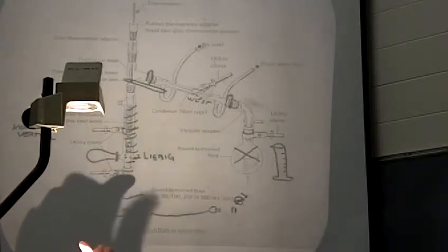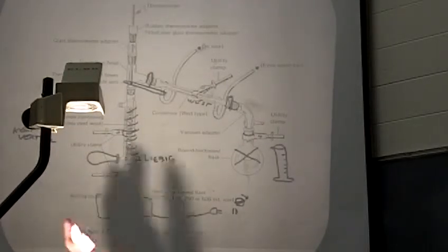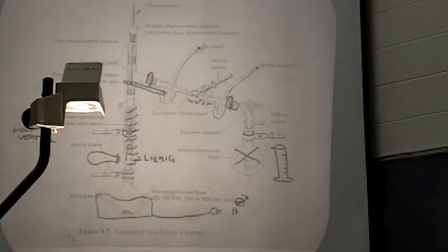Then what you're going to do is first clamp your round bottom flask. This is very important. You want that flask clamped nice and vertical, because for the fractional distillation you want things very nice and vertical for the fractionating column. It'll work a lot better if it's straight up and down than tilted to one side or the other, right?